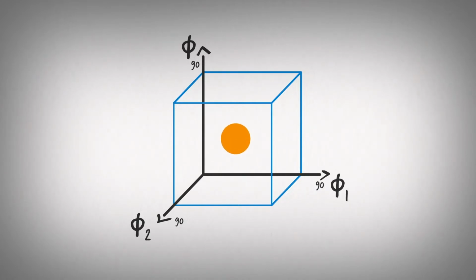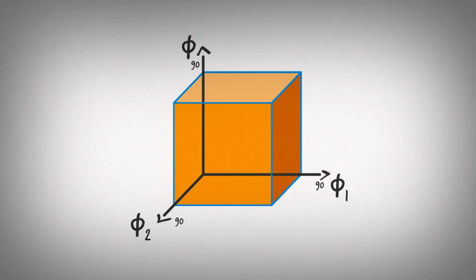This is where the term spherical texture comes from. In the case of a fiber orientation, we said the direction is well known in two directions, but random in the third. This would correspond to a line or fiber passing through the box, like a wormhole through an apple. In the real world, orientation components are often a mixture between spherical and fiber, known as an elliptical component. The last case was isotropic, where again it corresponds to intensity everywhere.